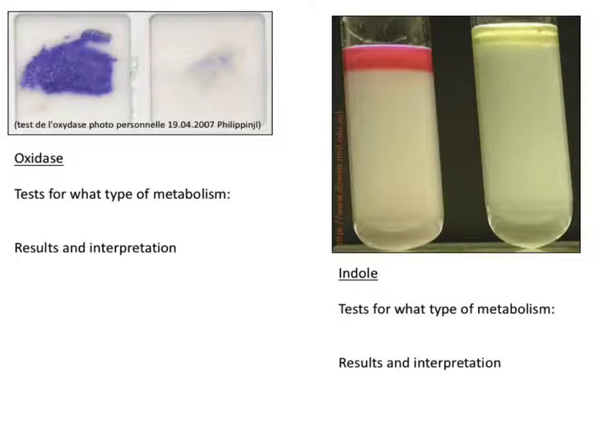Which one of those is positive? Yeah, the dark purple one. The one on the right, people might say it looks positive. My guess is this test was probably exposed for too long. Not that I'm expecting you to memorize this for the exam, but the oxidase one was the one where I said if you let it go for more than a minute or so, you will get false positives. So you have to be kind of careful in when you interpret the results for this test.